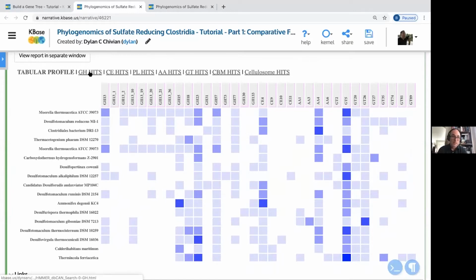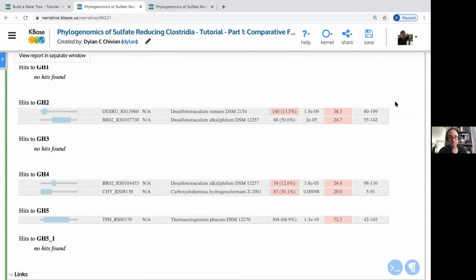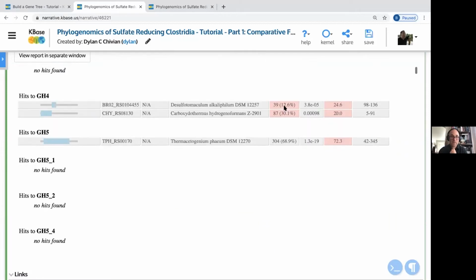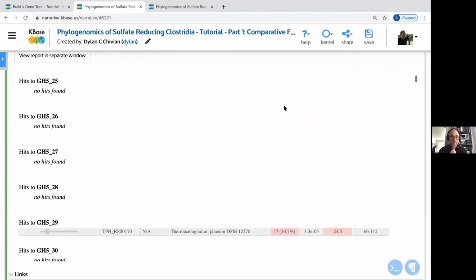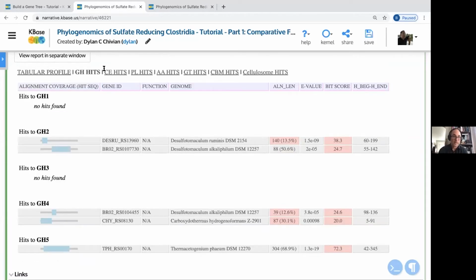And we can actually go and look at the results of the HMMER search in a table very similar to the BLAST. And so you can see where it's maybe not getting the values on those thresholds. So okay, you can dive into it a little more that way if you so choose.